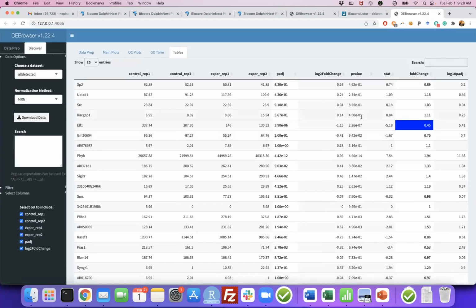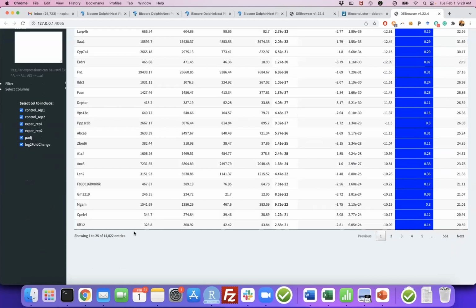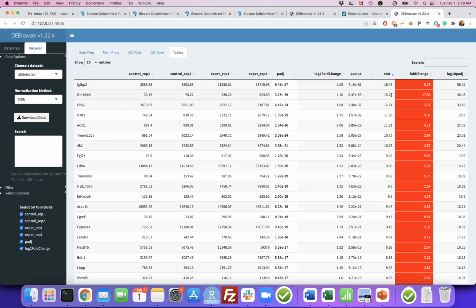I have this here, and then if I sort this on this order, you can do either up and down regulated. It's not that important, but this order is important while running any ordered GSEA or GO-term analysis. So you can download the data here, or you can search your data here or here. If you search it here, you can use that search.